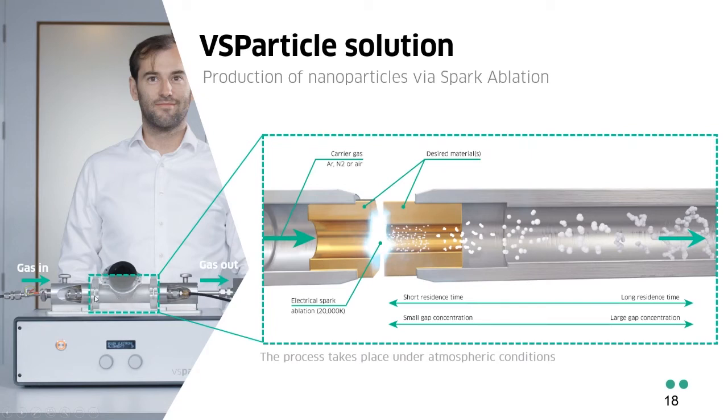But you could also replace this T-piece with a 4 or 5-way cross, which allows you to have gas flowing from the front to the back or back to the front, so perpendicular to the screen in a crossflow configuration. And those give you different sorts of outputs. If you look at the graph here, this is what we call a through flow configuration, because the gas flows from the left through the electrodes out to the right. A spark occurs between these electrodes, and the vapor is transported away through this very small volume compared to the rest of the system.